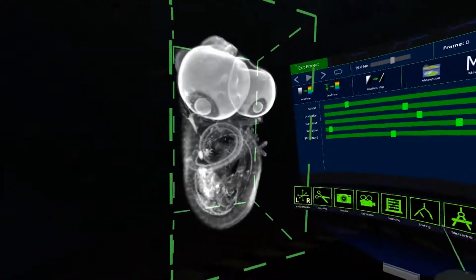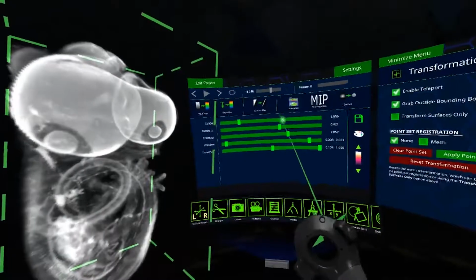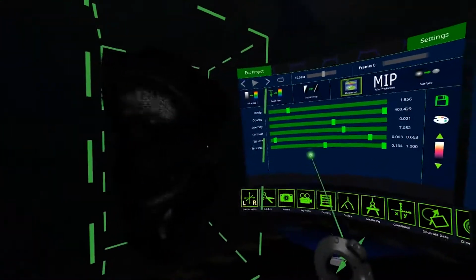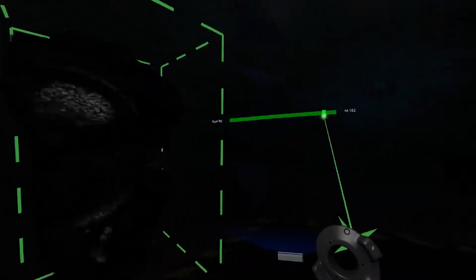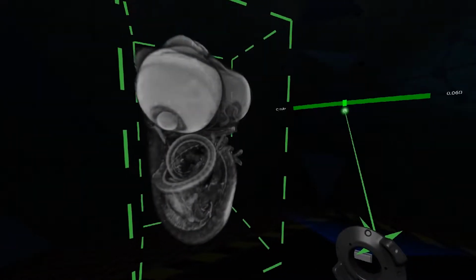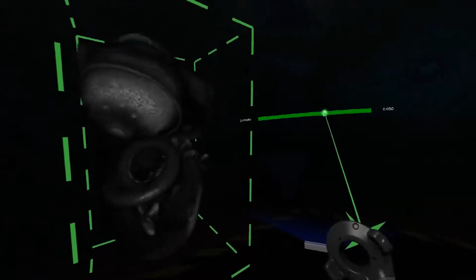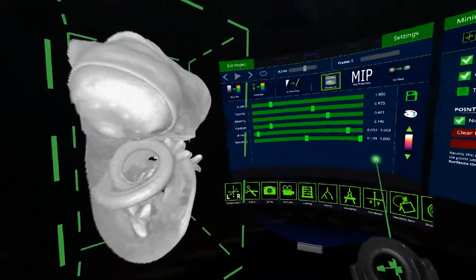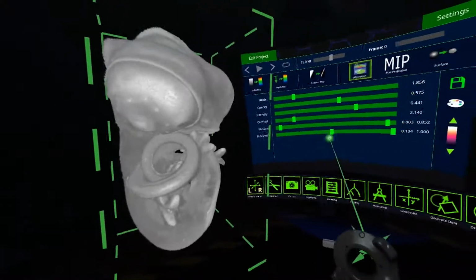I'm going to jump around with the settings on the top now, just so you can see more clearly how each of them work. This is the absorption model, and it's going to add a slider to our list called Opacity. This is so you can alter the level of transparency. You may have to go back after you choose the settings at the top and alter the sliders again. So it's a little give and take here and there. But the more you use syGlass, you'll become acquainted with the settings and be more fluid in your choices of adjustments.